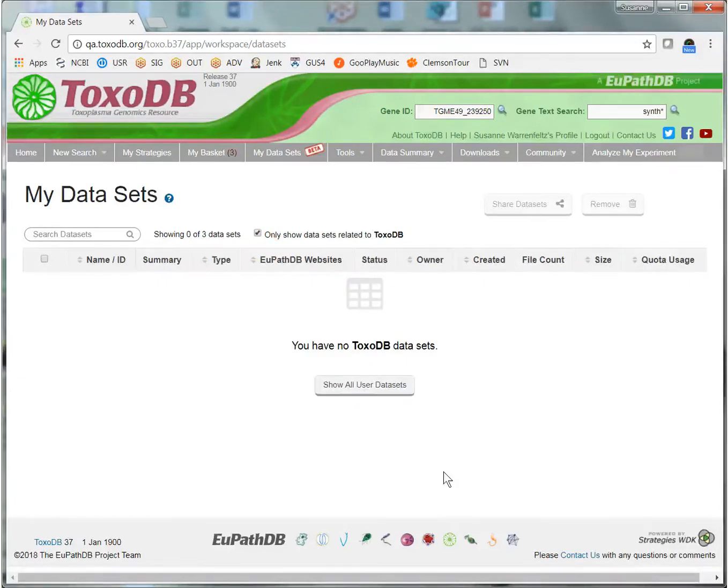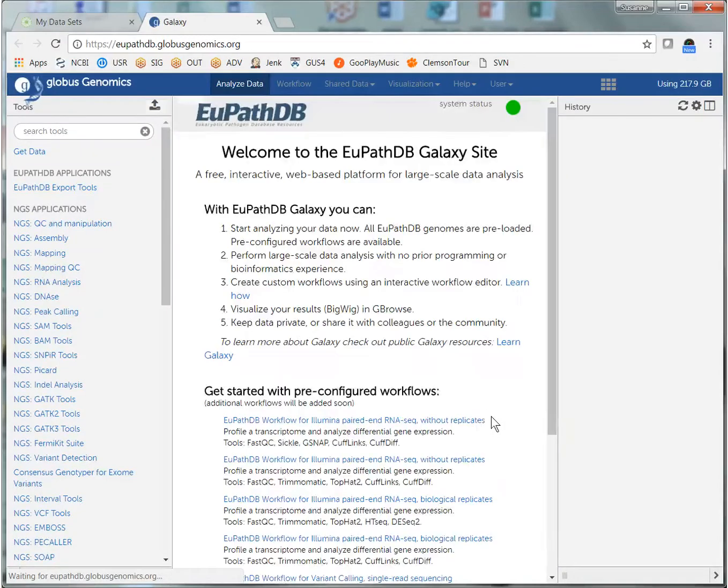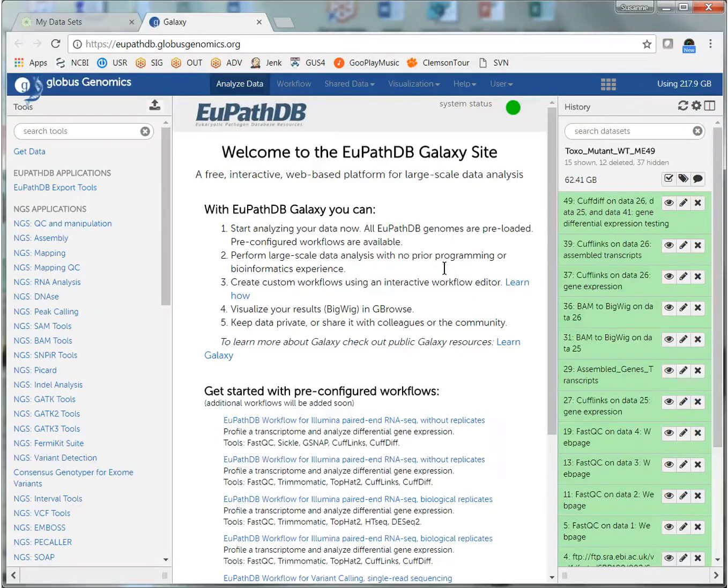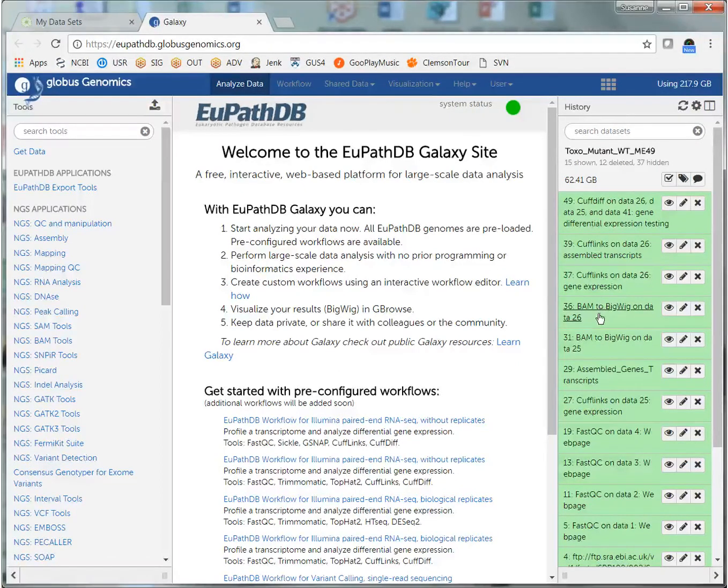So let's go to EuPathDB Galaxy and transfer some files. I'll use the Analyze My Experiment link to go to EuPathDB Galaxy, and as you can see, I am already logged in and I have an open history with two bigwig files that I want to transfer.